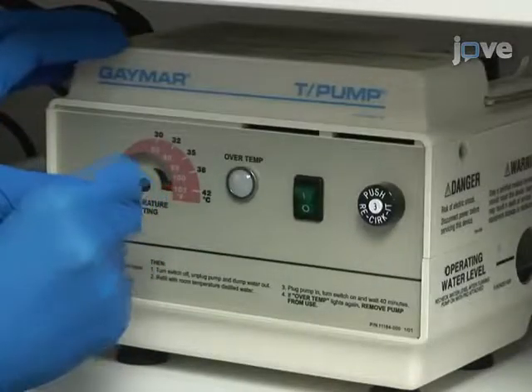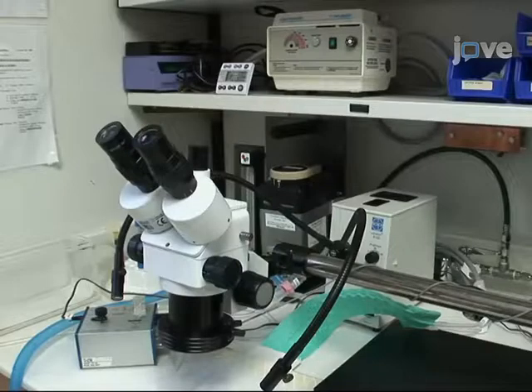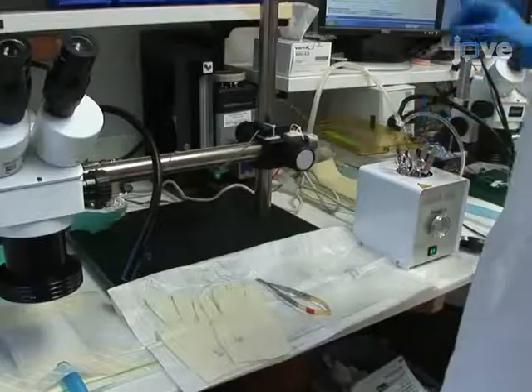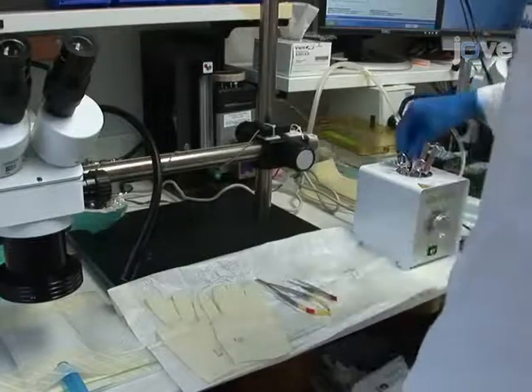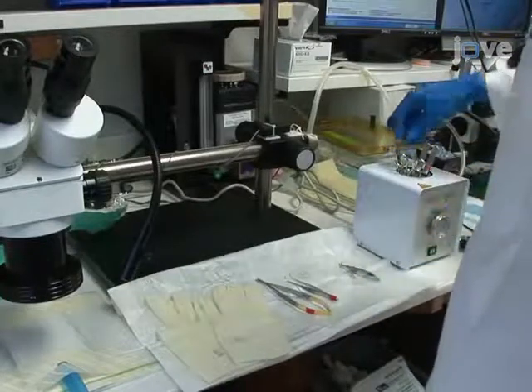Turn on the heating pad and set it at the right temperature. The system we recommend is a Gaymar circulating water pump connected to a heat therapy pad maintained at 37 ±1 degrees Celsius. Sterilize surgical tools in a hot bead sterilizer before surgery. For the TAC surgical procedure, the following surgical instruments are needed.